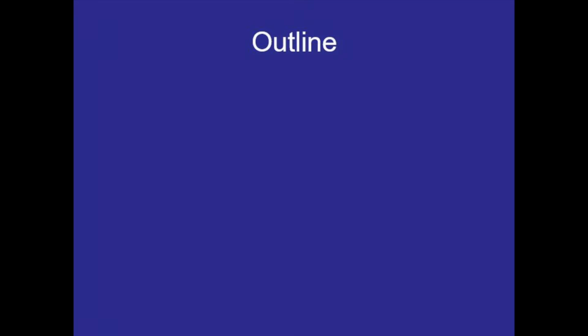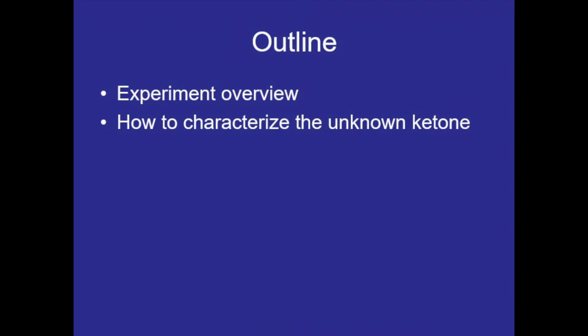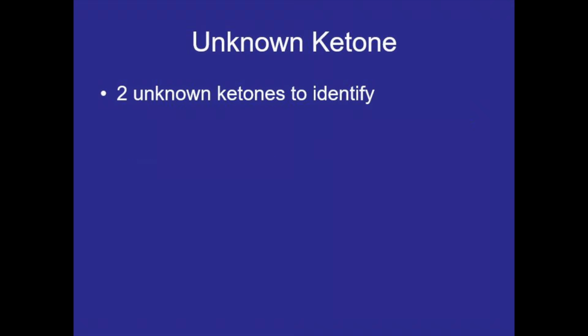Here's the outline for this video. I'll be going over the experiment in general and talking about how this lab will work. I'll show how to characterize the unknown ketone, the different techniques involved, and then I'll show the experiment in the lab. So in this lab, you'll actually be given two unknown ketones to identify.